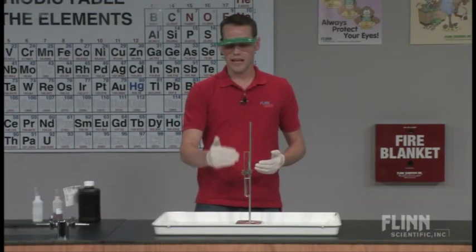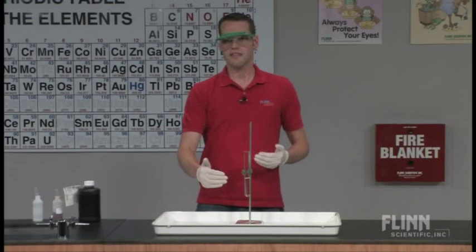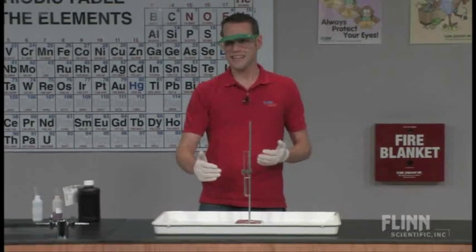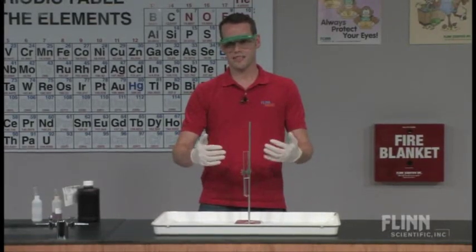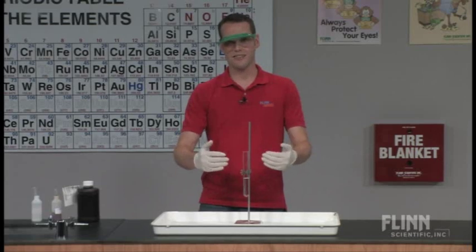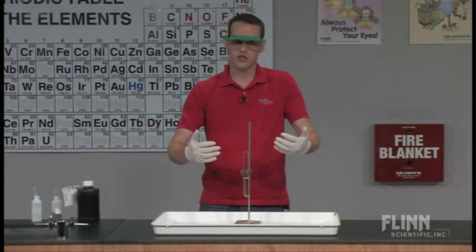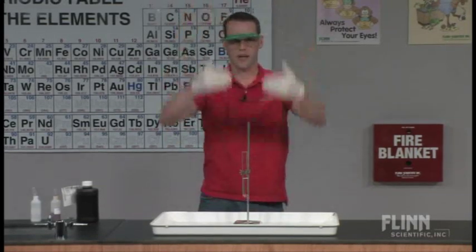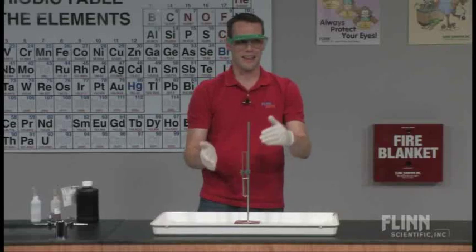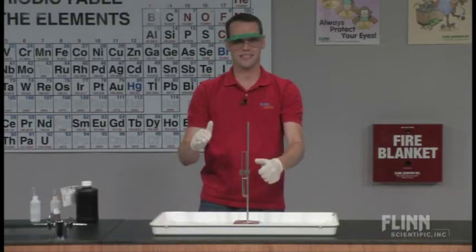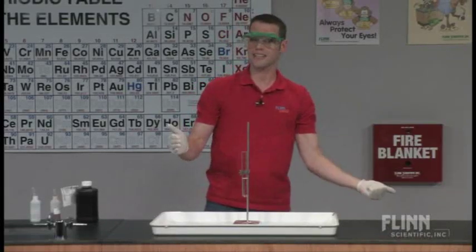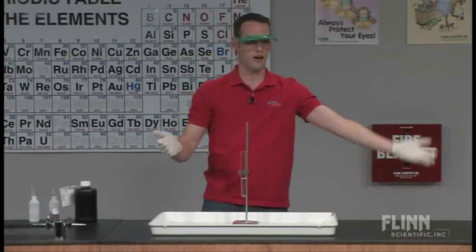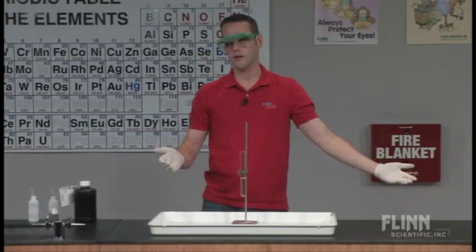You'll also notice that I have the test tube vertical here. This is the way we always tell our students never to heat anything. But for this reaction, because it's going to generate a lot of gas and will eventually explode upward, I want it to go straight up and come straight down. This is not a lesson in projectile motion — we want things to go straight up and down, not across the entire countertop.